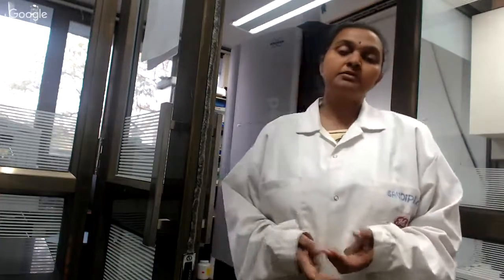Thank you, Professor Shrivastava. Good evening to all the participants who are there online. Like Professor Sanjeeva just said, we'll be handling the Maldi TOF instrument today. Details of this will be discussed. This instrument, as he rightly mentioned, is used mostly for the analysis of proteins, polymers, nucleic acids, carbohydrates, and a lot of other samples.